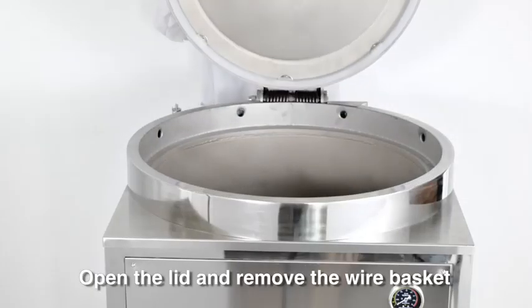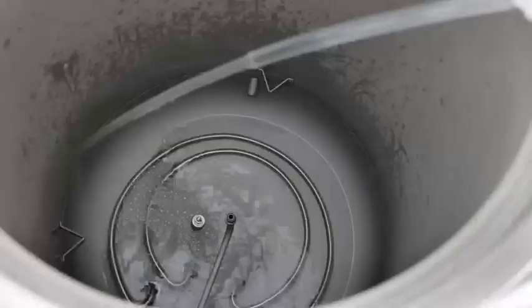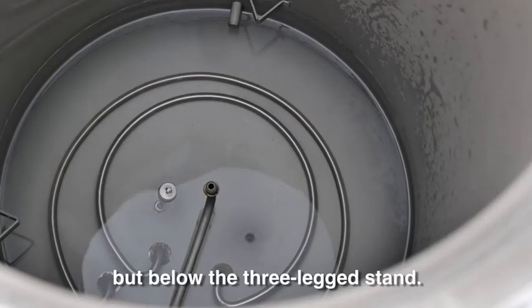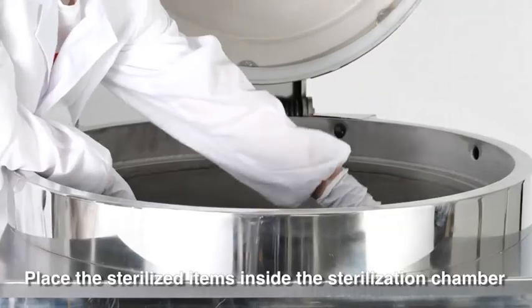Open the lid and remove the wire basket and inner container. Add water, ensuring it's above the float switch but below the three ledges of stainless steel. Place the sterilized items inside the sterilization chamber.